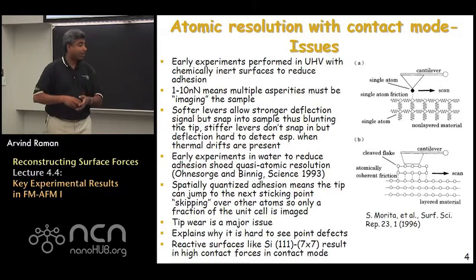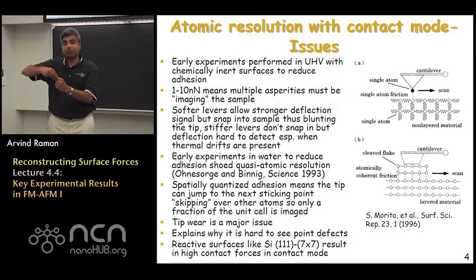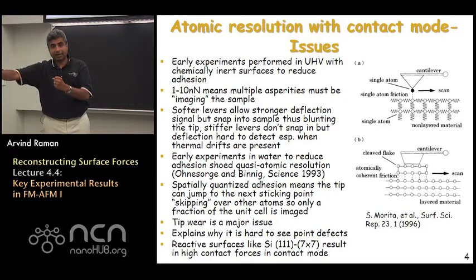I mean, you're looking at the atomic resolution, you have to consider the spatial periodicity in lateral forces that arise due to the arrangement of the atoms. So when you're scanning the surface, you're also basically applying a lateral force, and you can get a stick-slip kind of phenomenon, where as the tip scans over an atom, the lateral forces hold onto the tip until a certain lateral force is exceeded and they snap over to the next sticking point, and so on.